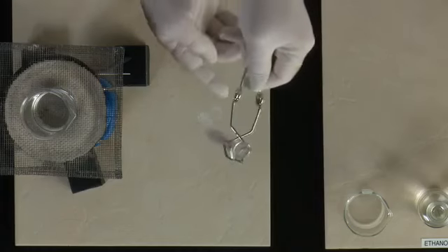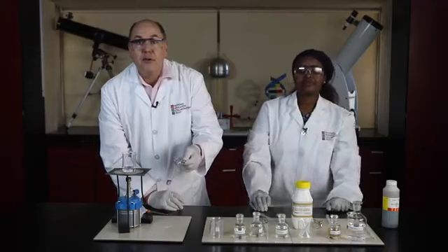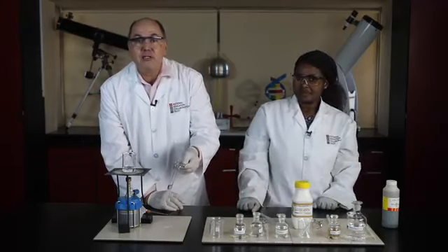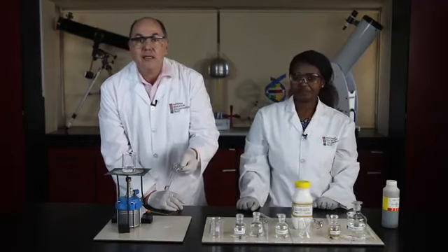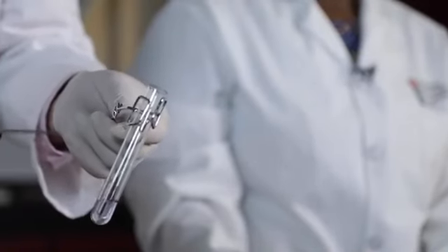A couple of bubbles there. It looks like it might even be reacting. Sulfuric acid heats up when we add it to other liquids like alcohol or acid. The increase in temperature helps speed up the reaction rate.